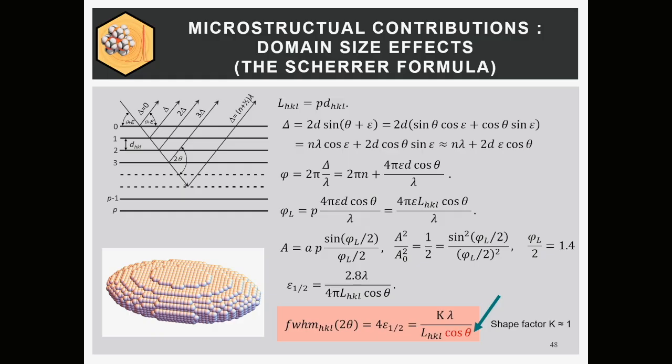But it's only different if we go out in 2 theta. At the very beginning, tangent theta and 1 over cosine theta are very close together. So we have to measure. You cannot stop measuring your powder pattern at 30 or 40 degrees. Then you cannot get this information out.